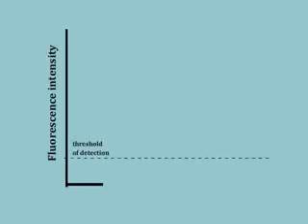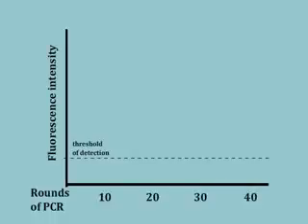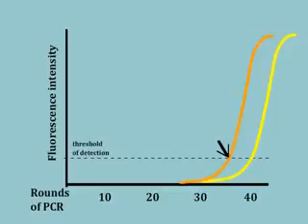So if you begin with a clinical sample that had only one copy of the target DNA, it could take 40 or more cycles before the amplicons are detected by a fluorometer in a specialized thermocycler. However, if the original sample contained 32 times more copies of the target DNA, then the fluorometric detection would occur after 5 fewer rounds of PCR.